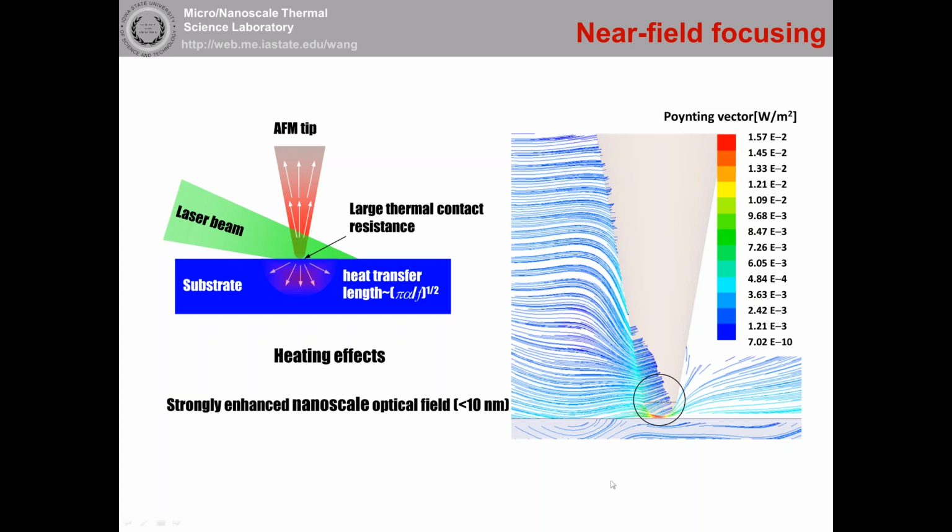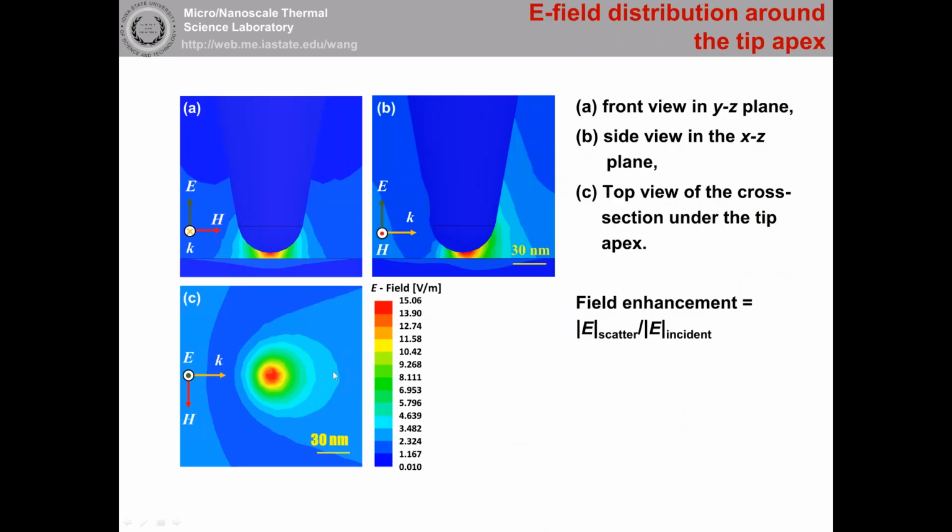And the temperature here is so difficult to measure, almost impossible. The only way to do it is to measure the Raman signal from this location to get the temperature. I didn't find other ways people can measure the temperature here. This one shows how small the focusing is, and it's based on our simulation. You can see this is a 30 nanometer scale bar, and the focus is very tiny, like 10 nanometers. So very tiny size.